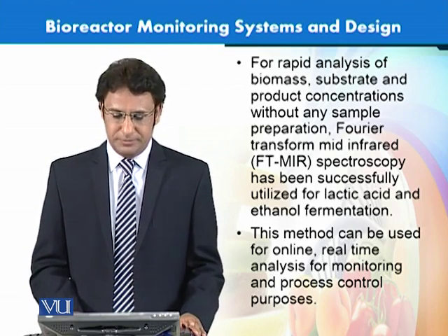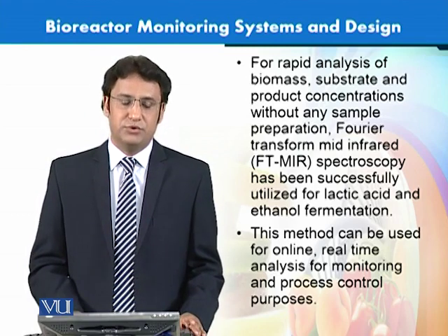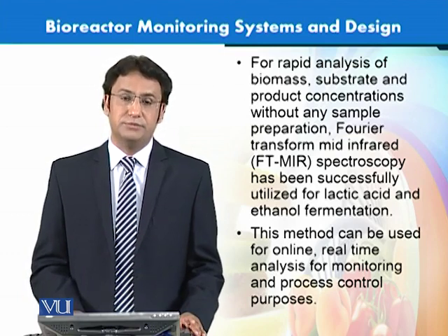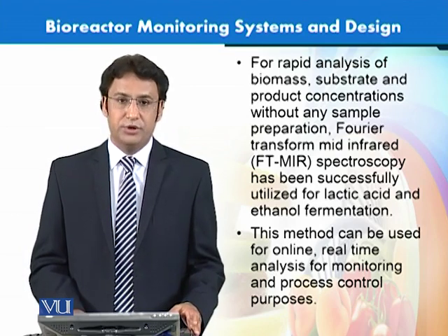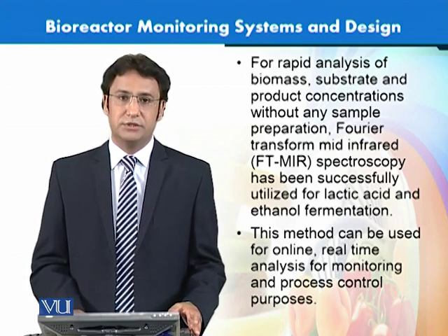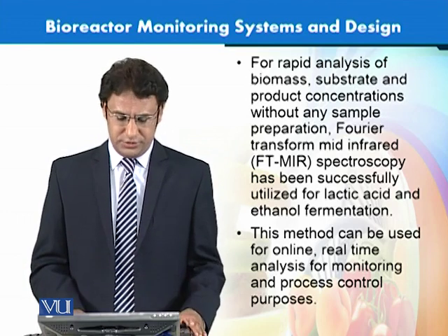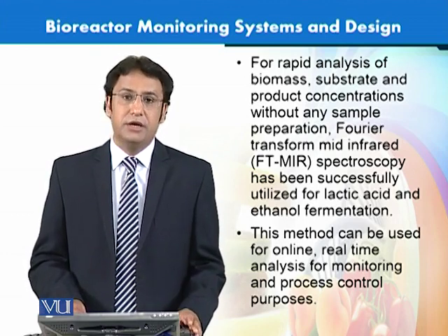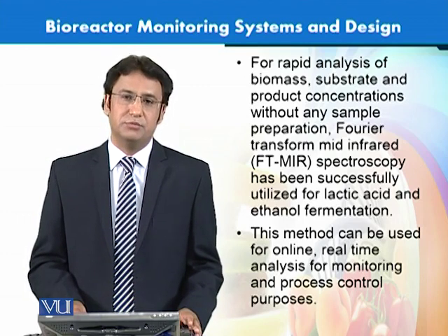One of the options is Fourier transform mid-infrared, FT-MIR, spectrometry, which can be used for a few things such as lactic acid and ethanol fermentation. But this is an ongoing process. We are developing better and more robust technologies to measure and monitor the growth in these bioreactors, and that would be very helpful for further development of this industry. This method, FT-MIR, can be used real time online. It can be used for process control purposes as well.